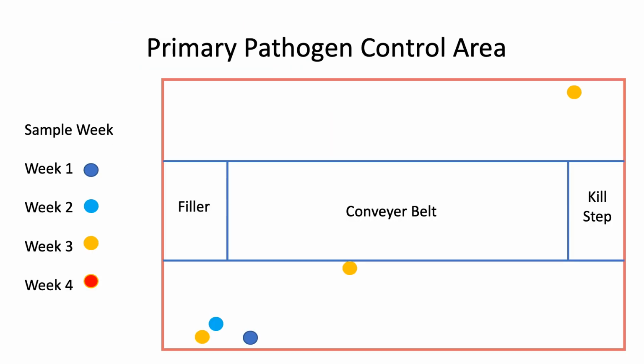It is important to track pathogen test results. The goal is to understand trends so that you can act upon them. Tracking also serves to document your response to positive findings and provides evidence that your response was appropriate and effective. There are several approaches to accomplishing this. In this simple example, the pathogen primary control area map has been expanded and positive findings shown by sample location and week. This visual representation allows location-specific clusters or potential trouble spots to be easily identified.